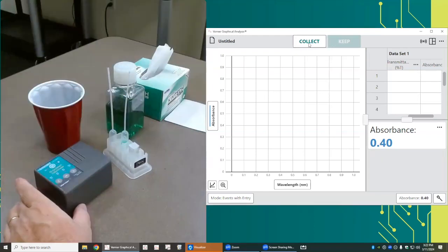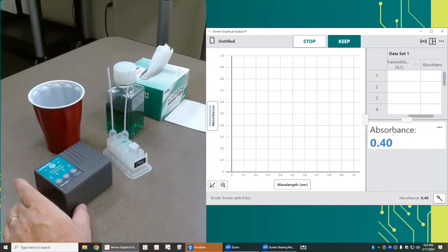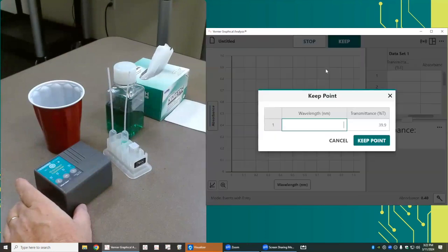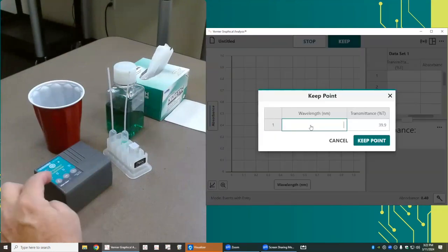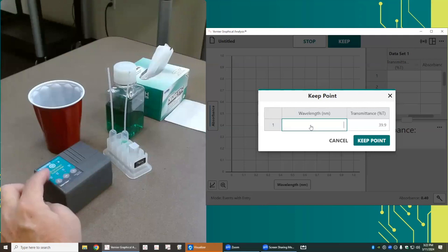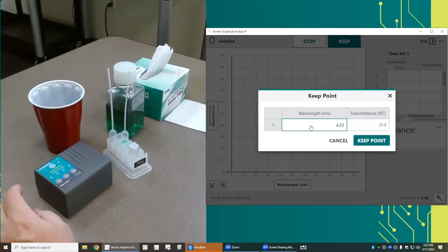Actually, I need to start collecting data. I'm looking at the meter and I'm waiting for the value to stabilize. When it is stabilized, I'll tap keep, and I'll type in the wavelength. In this case, it's the very first one on the colorimeter, which is 430 nanometers, and I'll keep that point.